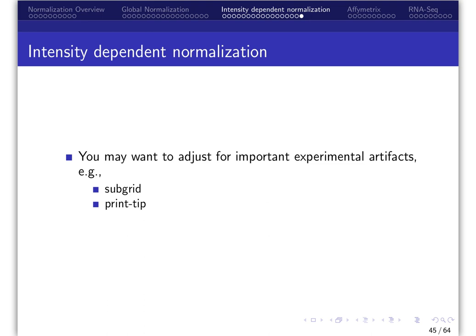In the active learning lab associated with this module, you will practice reading in raw custom spotted array data, constructing MA plots, and applying normalization methods.